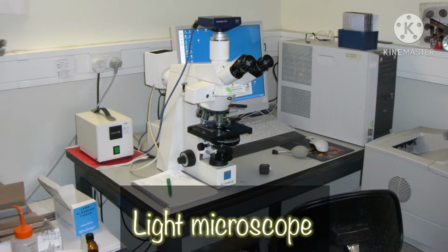What is a light microscope? A light microscope is a biology instrument or tool that uses visible light to detect small objects such as microorganisms, which cannot be seen with the naked eye, and enlarging them. They use lenses to focus the light on the specimen, magnifying it so that it could produce an image.